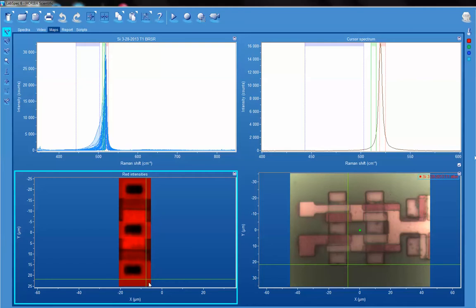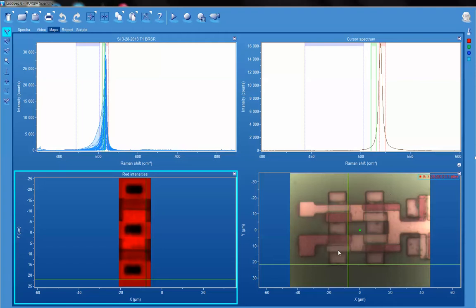What you see here, over on the right, is a reflected light image of a silicon test structure that consists of single crystal silicon, as well as silicon grown on top, some oxides, and polysilicon. The pink area is polysilicon 1, and the lighter area is polysilicon 2.